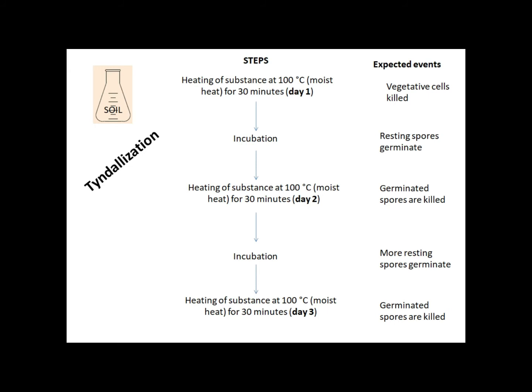3 days. We know that soil is the abode, or the habitat, of microbes. Most of the microbes, soil is a rich source of microbes where we see vegetative as well as spore forms.